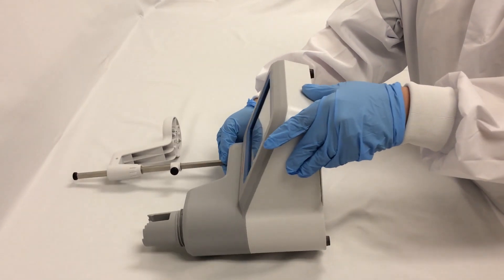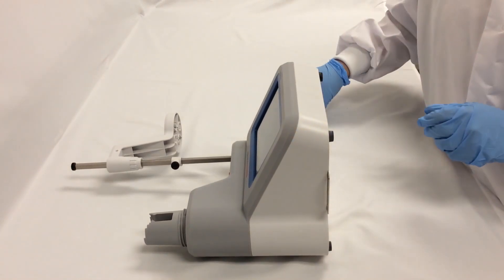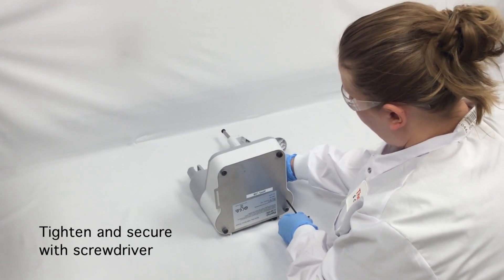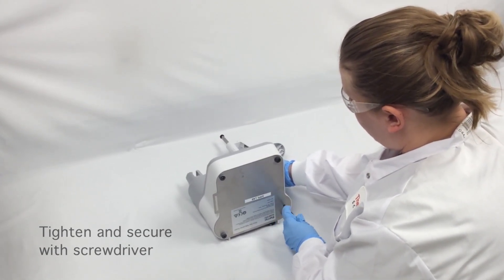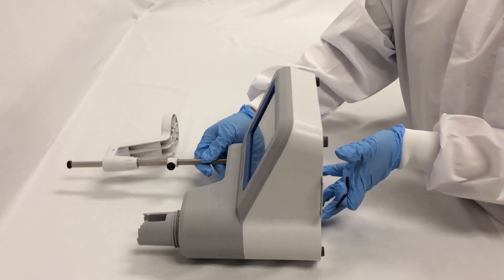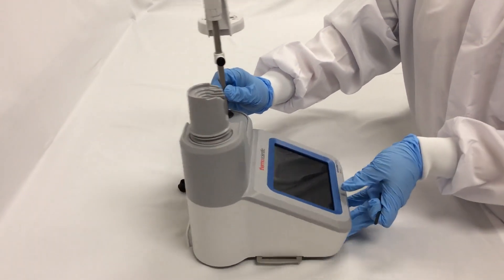Turn the titrator onto its side and use the included screwdriver to turn the captive screw in place until it tightens. The electrode arm is now securely in place.